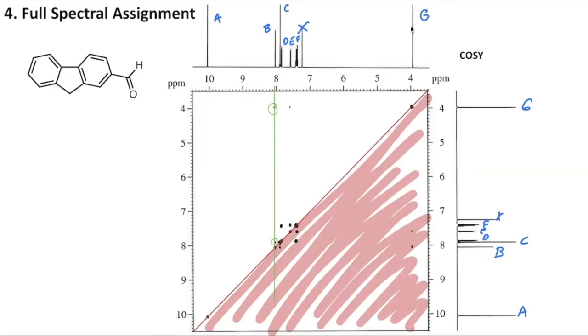I want to get all of my lines in first. So I'm going to remove those annotations and start filling in some extra lines. Copy another one of these over and try to pick up this peak here. Let me draw that in with a circle. I'm trying to pick up this peak here because that one is not one that we've caught yet. If you're thinking about, oh yeah, it also intersects with this one, you're right.